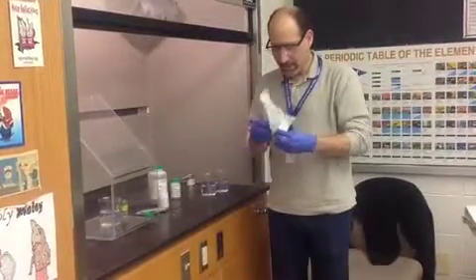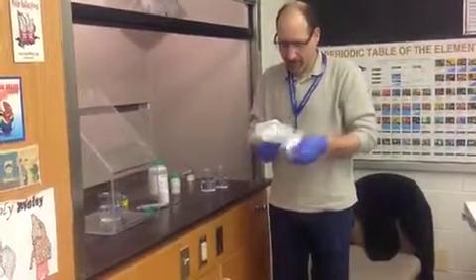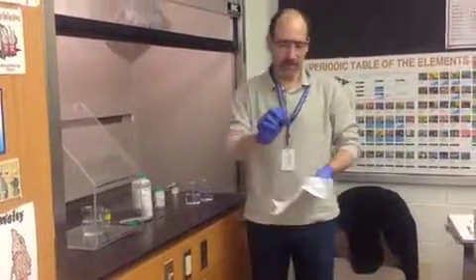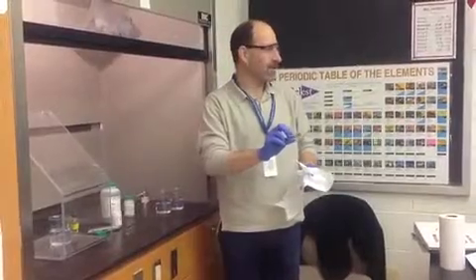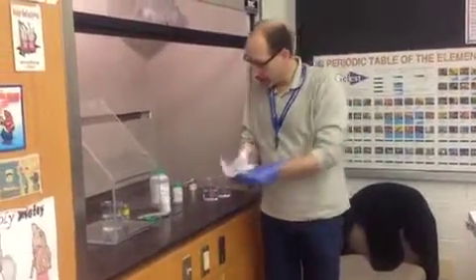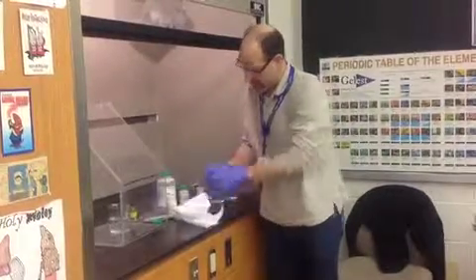So what I'm going to do is clean off a little bit of the oil. Now, they look kind of dull. This is lithium, it kind of looks like silver that's tarnished. Have you ever seen your parents' silver that looks like it's tarnished? But there are a couple of things that are cool about these.